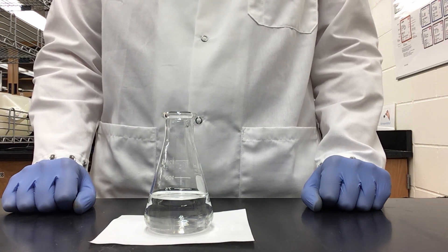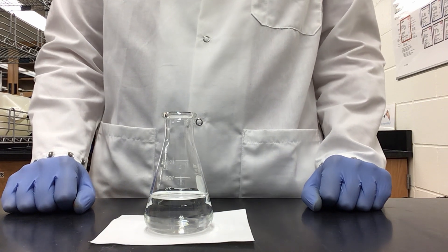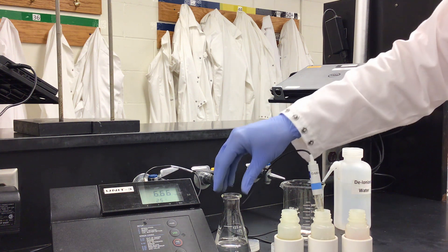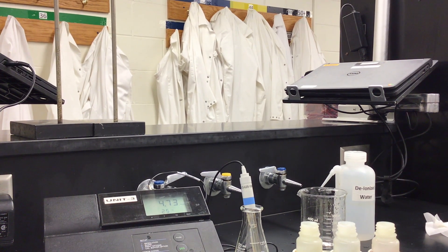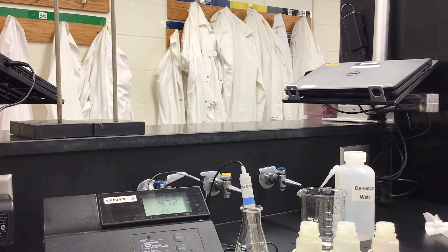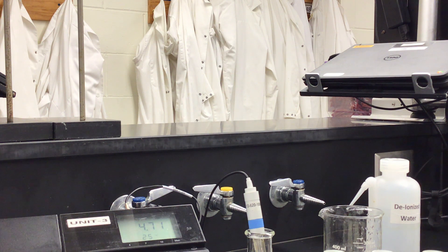With all of that information, you should now be able to calculate the concentration of acetic acid and sodium acetate. For our last step, we need to take our pH probe and measure the pH of the buffer we have just made. Since we used acetic acid and sodium acetate to make our buffer, we are ending with a final measurement of 4.73 for our pH, which is exactly what we were hoping to see. Our ideal pH is 4.70.